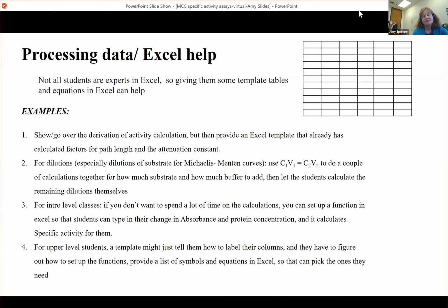We also usually tell them to do the whole dilution series that you want. They're going to have a couple different dilutions of a stock solution. So we explain that this is going to be from your original stock solution, and this is going to be from a 1 in 10 stock solution, and this is going to be from 1 in 100. We put a lot of that into the Excel sheet, as well as try to explain it to them, just to minimize the errors when they're actually doing it.